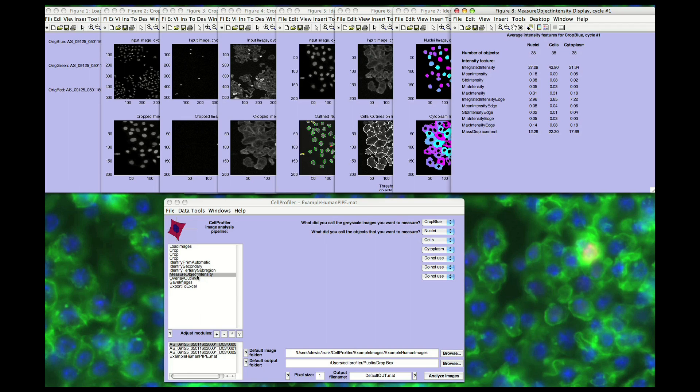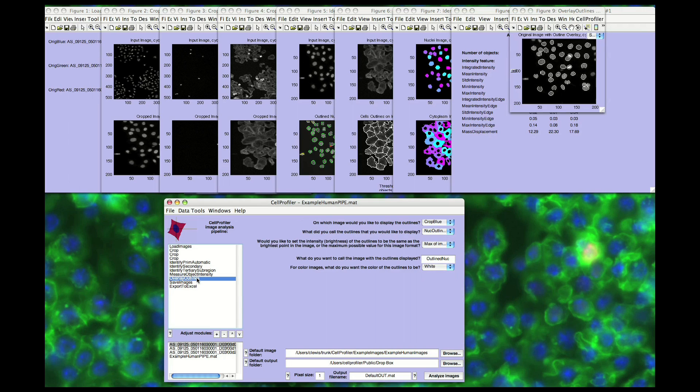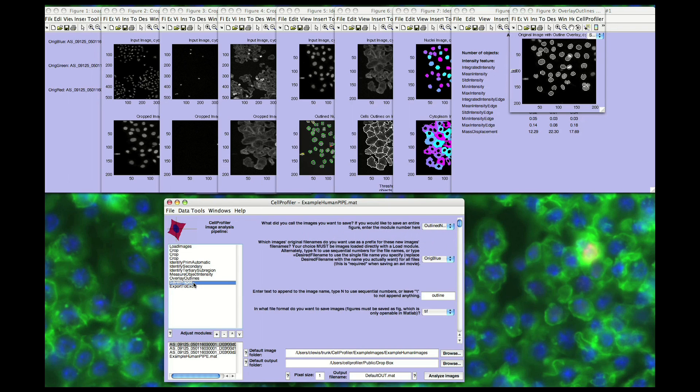Lastly, the results can be saved or exported for later examination. Here, we've overlaid the outlines of the identified primary objects onto the original image. These images can be saved into the image format of your choice.